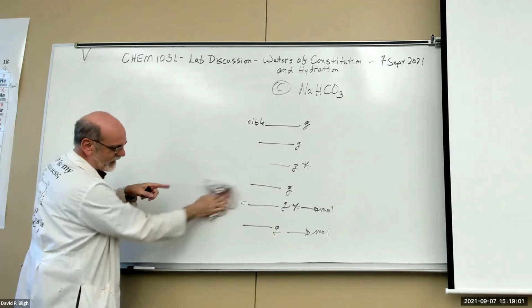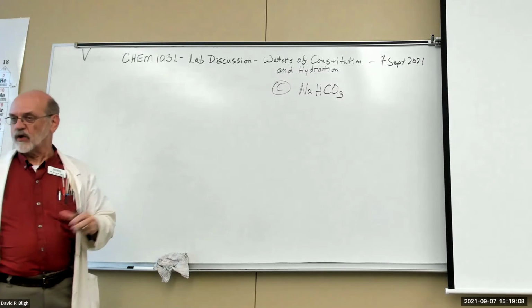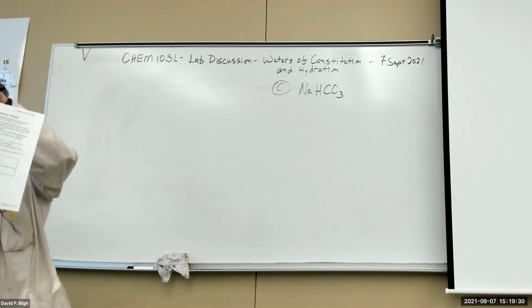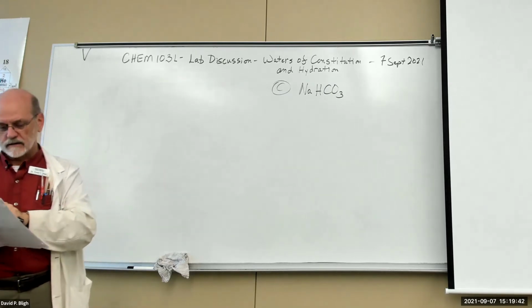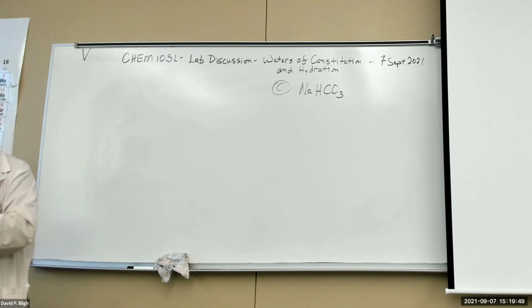If you set this table up like that in your lab book, you know a number goes in there, at least one. Does it say we're going to duplicate that experiment? I hope not, because there's really not enough time. No, it doesn't say repeat it, I don't think. Also in that document, you'll see discussion pages tacked to the back. The first discussion is the one I just gave you about the copper sulfate, with sample calculations. Don't use those calculations for yours because you're going to have different values, but that gives you an idea of how it works.